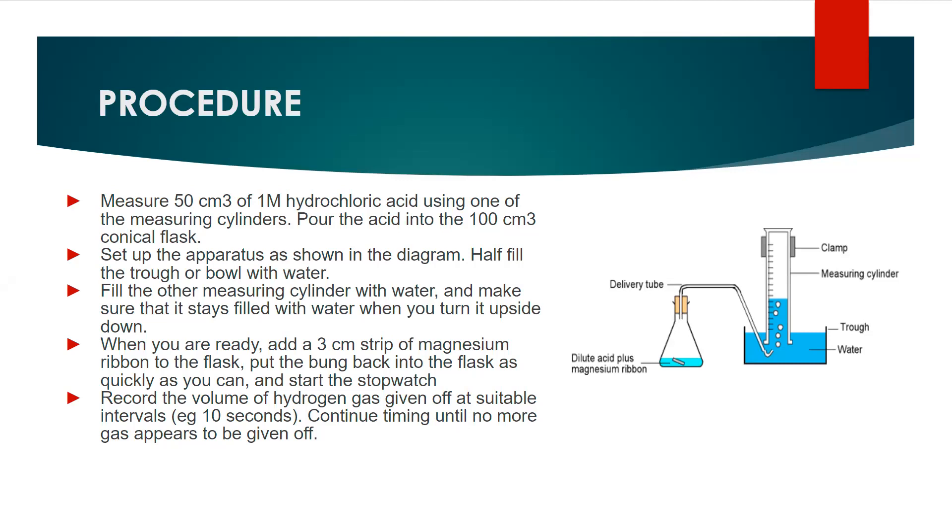Half fill the trough or bowl with water, then fill the other measuring cylinder with water and make sure that it stays filled with water when you turn it upside down.